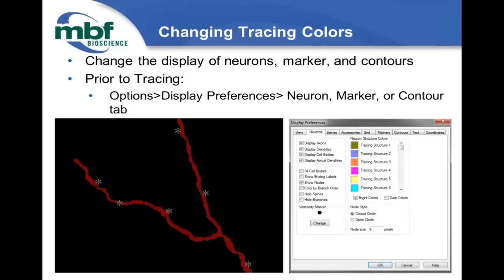If you're working with a fluorescent monochrome image, select a palette that doesn't include white, since tracing white on white makes it very hard to see what you're doing. You can also display nodes — what we call branch points — and change the node size or style, either closed or open.